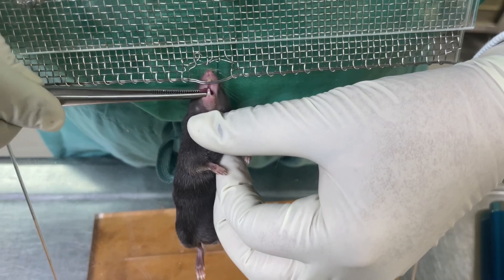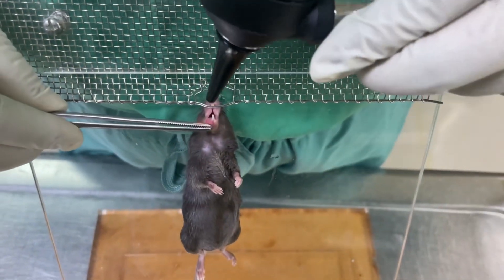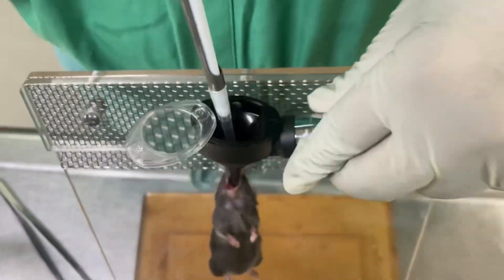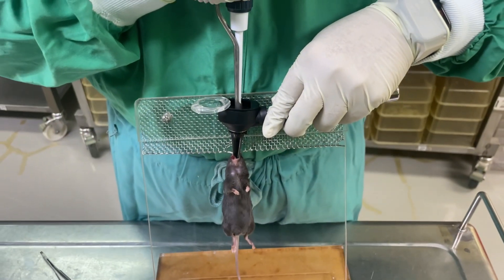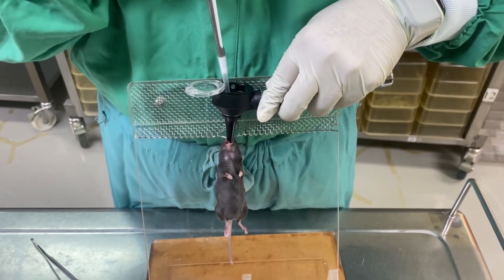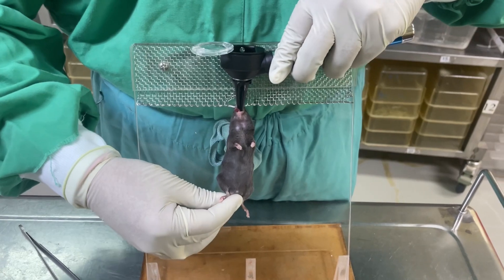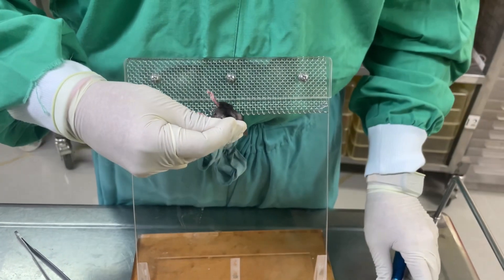Now I will hold the mouse very gently like this, take out the tongue, insert the otoscope, and through the otoscope you can see the trachea. Then we will insert the pipette.